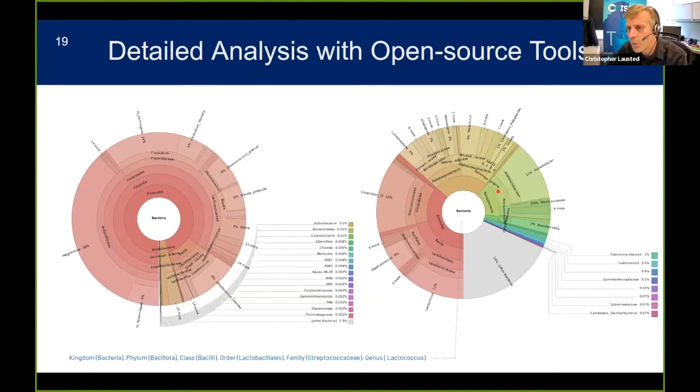Other samples like water were quite diverse too, with a lot of overlap between the water samples and the pet fecal microbiome samples. One group compared freshwater lakes to Lake Union, which is rather brackish. All of them were quite complex.